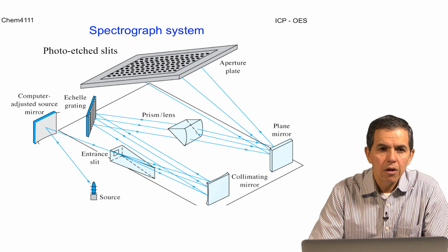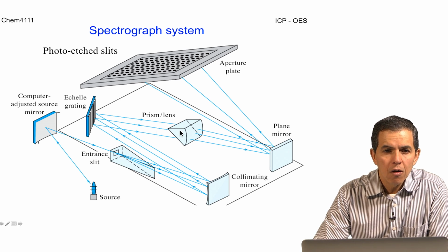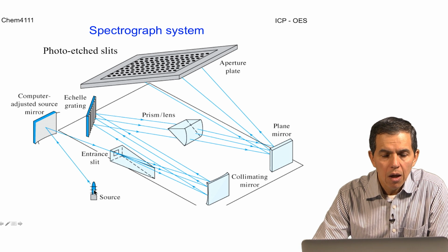Another key component to understand how ICP-OES works is the collection of emitted light. As we see here, we have a representation of the ICP torch, and ultimately all the light that is emitted is going to be directed through an optical system. The main features to illustrate here are those related to the ability to separate different wavelengths of light.